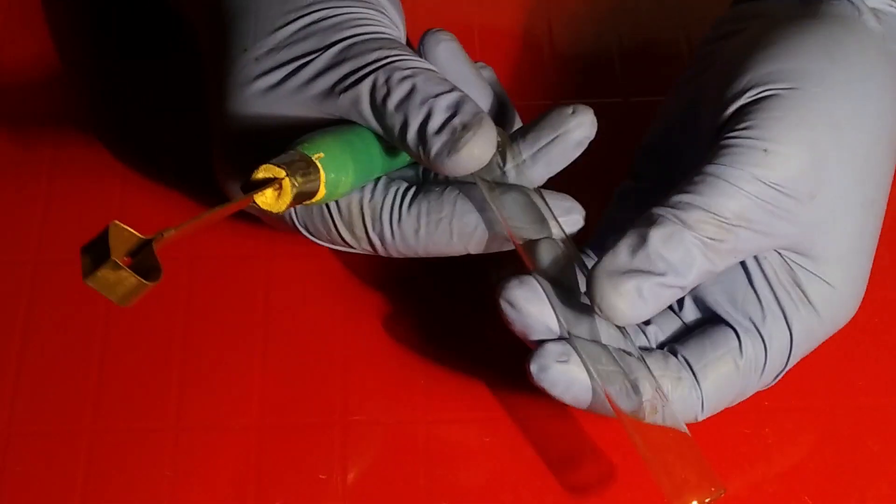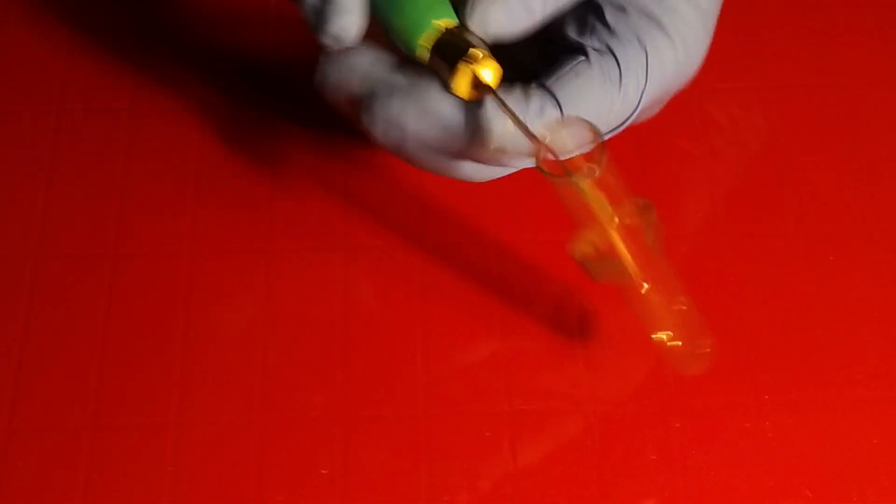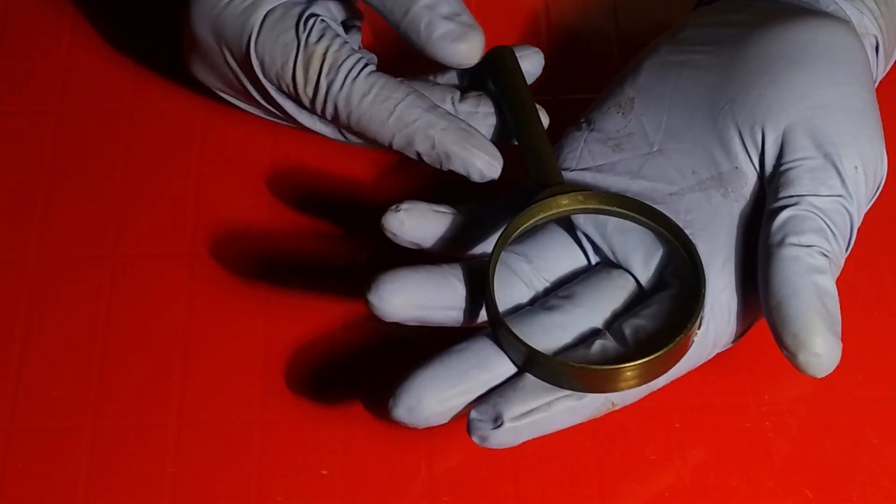Next are the test tube and test tube holders. For different types of practicals, especially biochemical practicals, we need these apparatus. A magnifying glass also helps in many occasions.